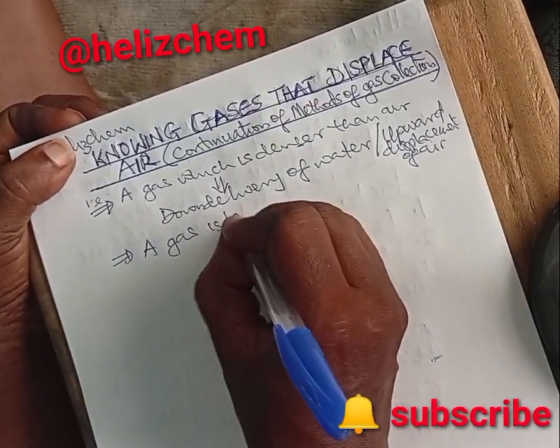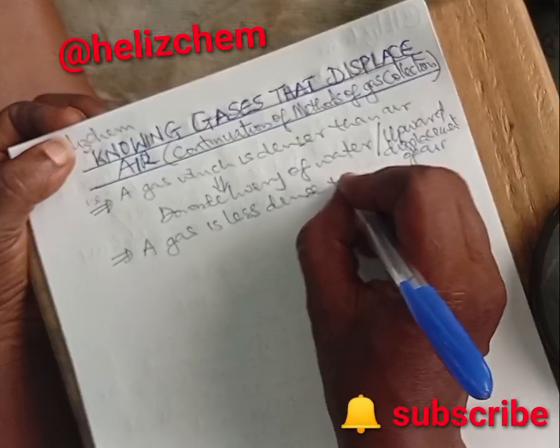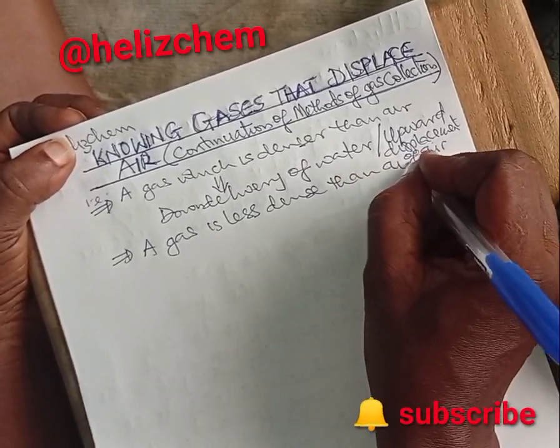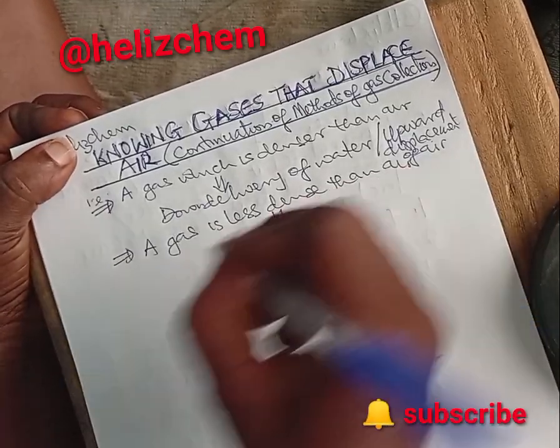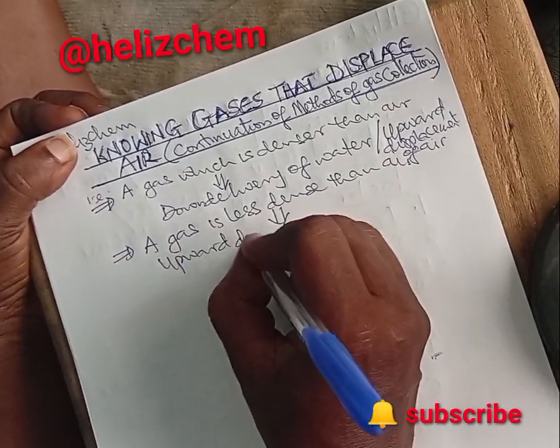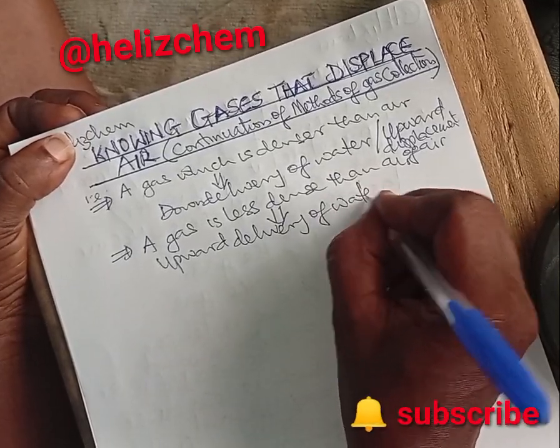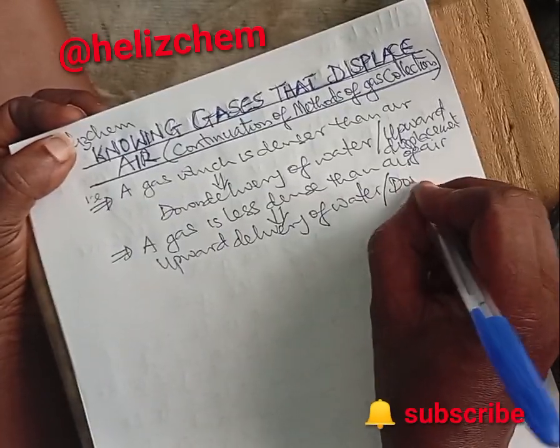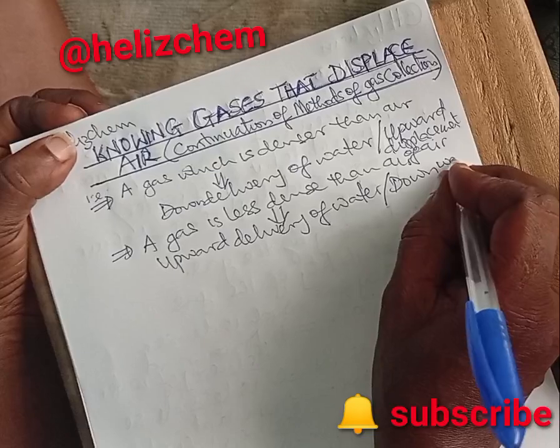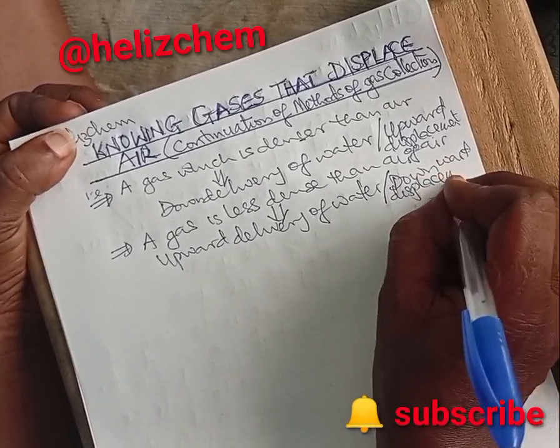On the other hand, if a gas is less dense than air, then the best method to use is upward delivery of water or downward displacement of air.